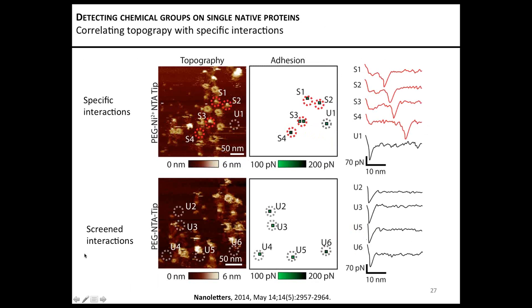As a test experiment, of course, we also did the same experiment without having the nickel in the solution. As you can see, there are some adhesion events. Again, these events are non-specific interactions. They appear in the tip sample contact region, and they are not correlated to any structural features of the protein.